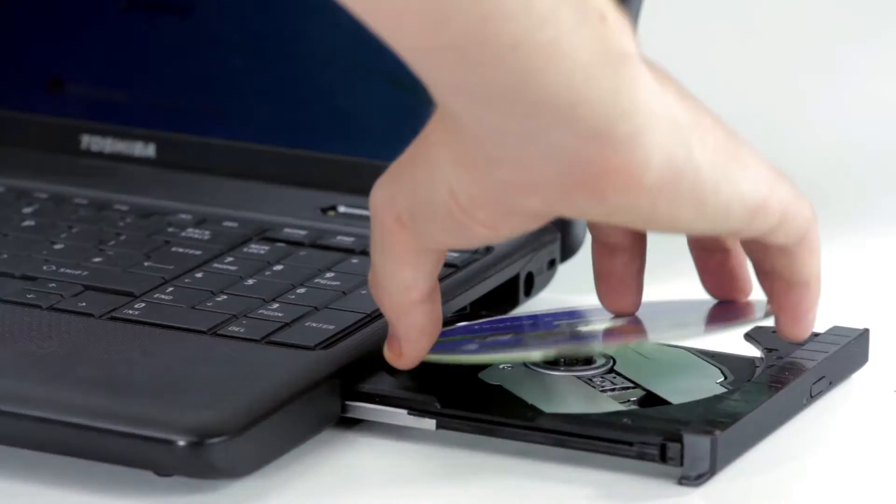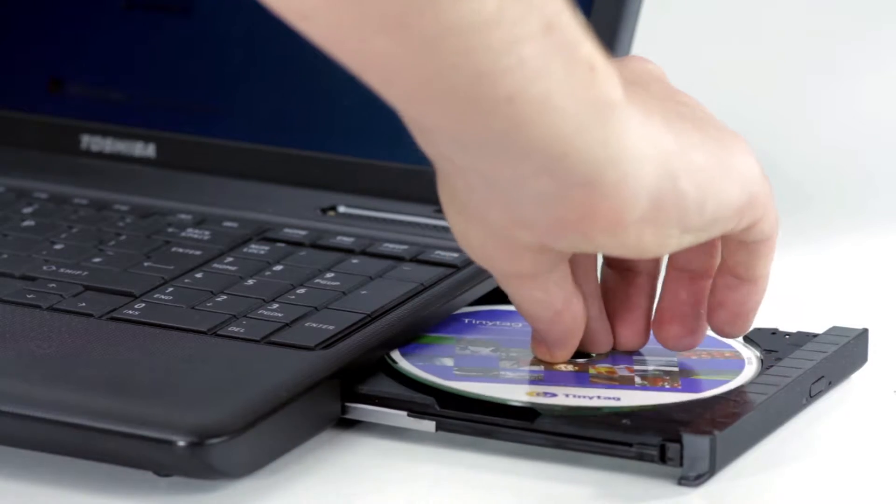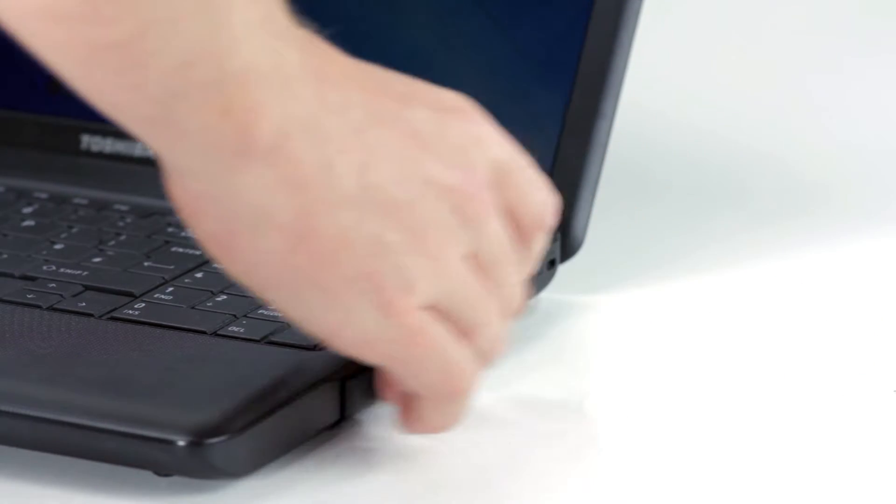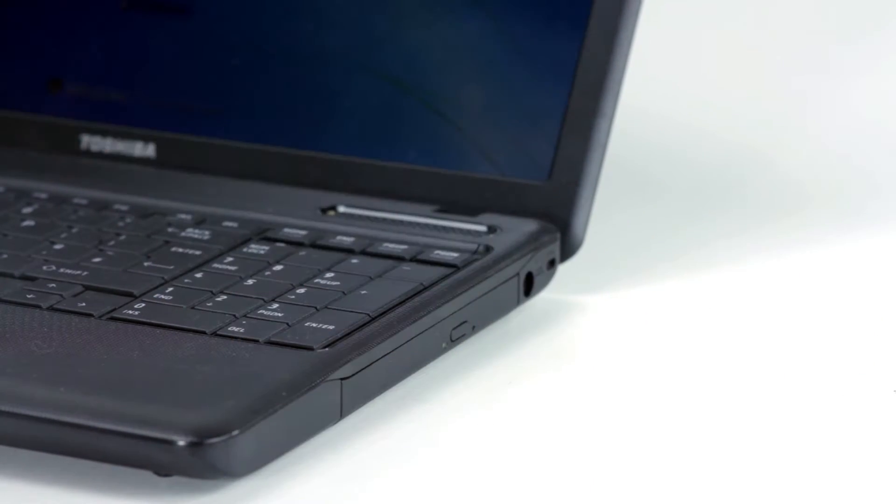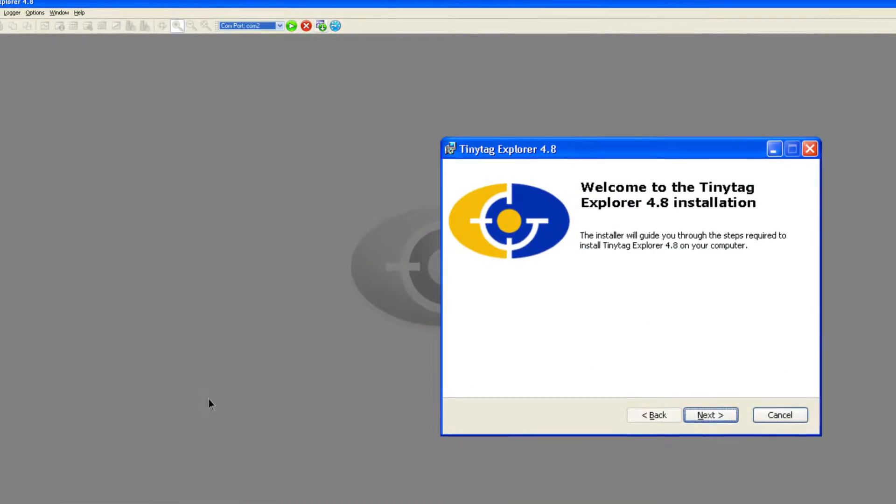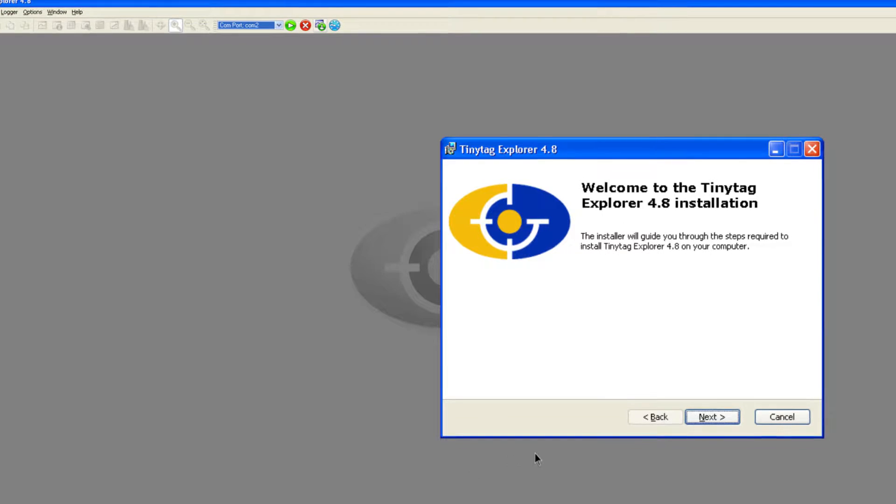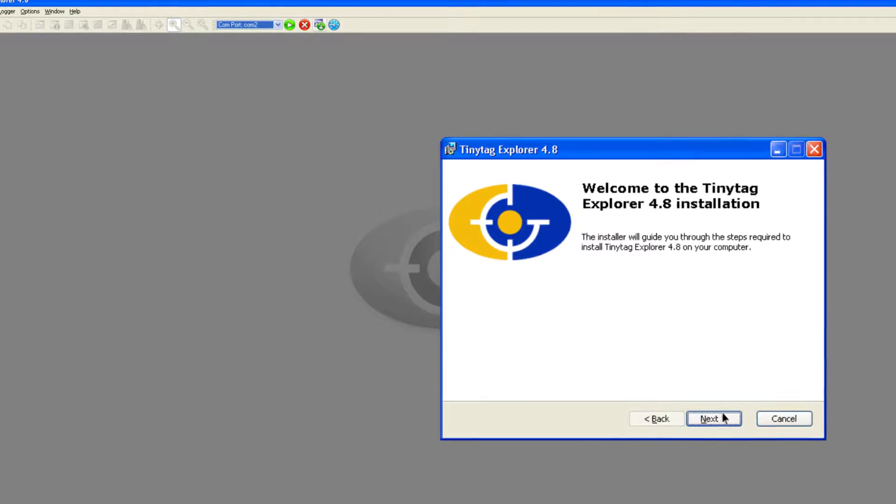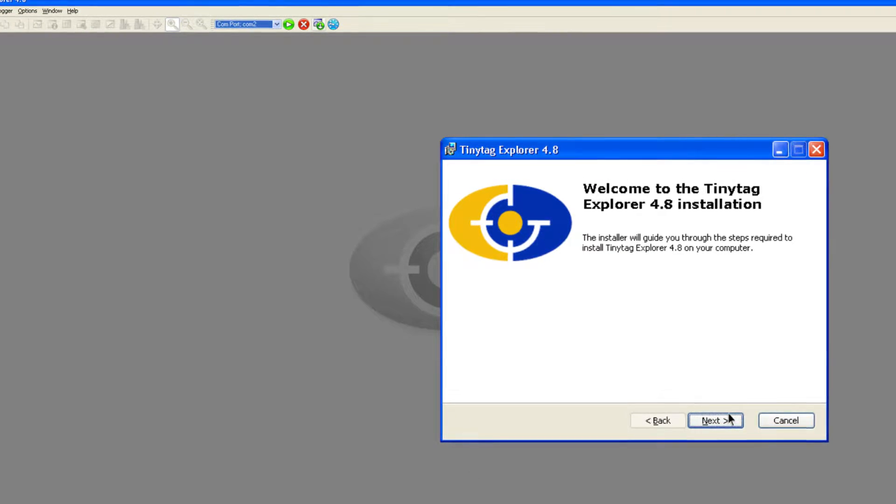To get started, firstly install the software. There will be a welcome screen followed by step by step on screen instructions on how to proceed with the installation.